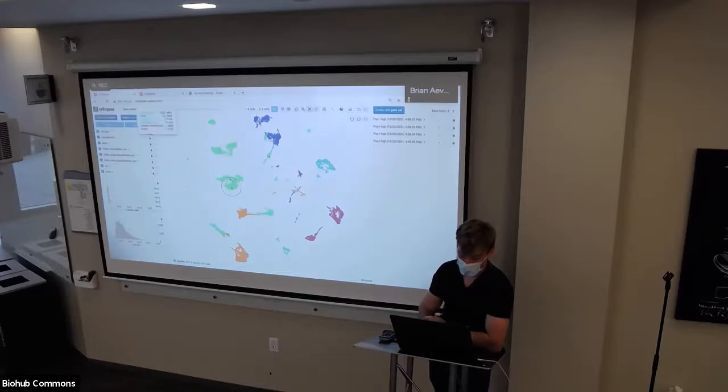There's macrophages, fibroblasts, myofibroblasts, etc. Well, what if I want to, but then I see, okay, look, these macrophages here, they're in 3 subtypes. If I color by the leiden clusters, there's all these clusters that are subclustering the macrophages. So can I actually add a tool to CZBiohub to help facilitate re-annotation efforts?